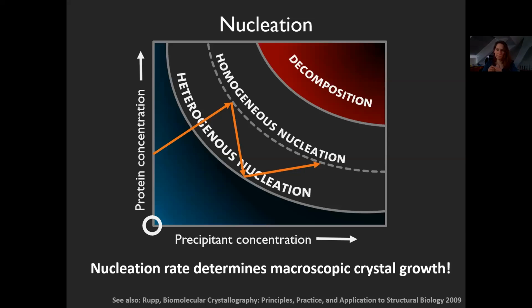The crystal may even dissolve a little, and the growth will either grind to a halt or become very, very slow, and more evaporation from the drop has to happen for it to be spurred into action again, at which point the crystal grows. Of course, in reality the process bounces back and forth more than three times during the whole crystallization process.